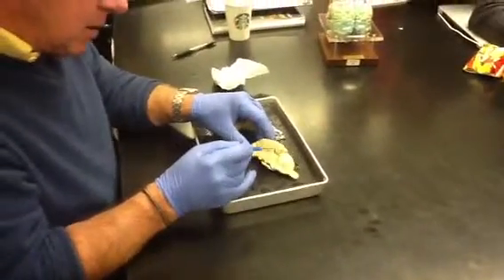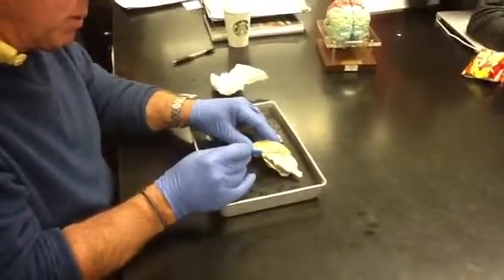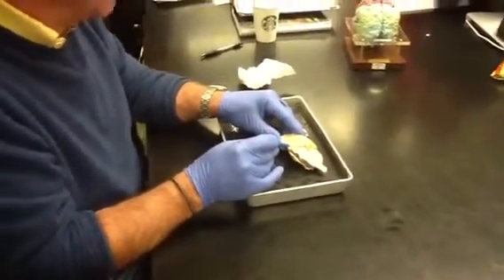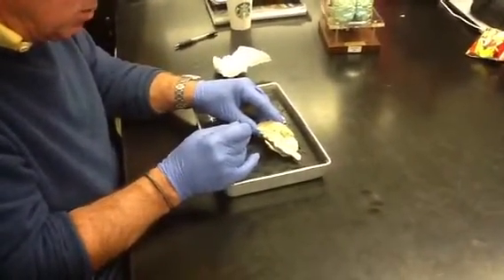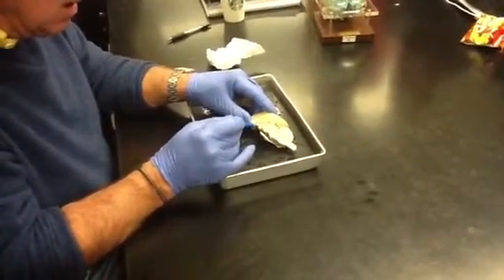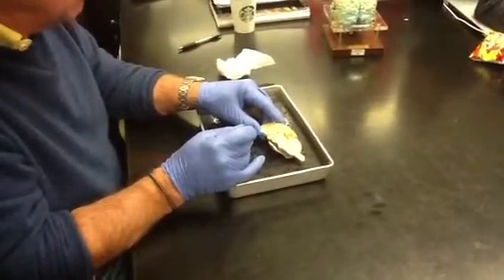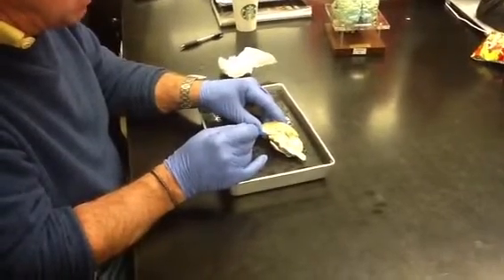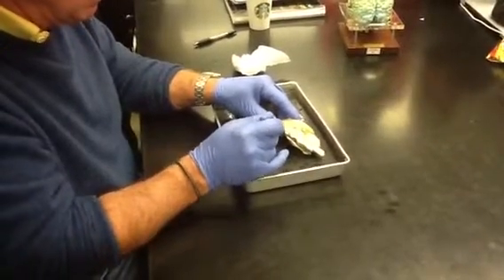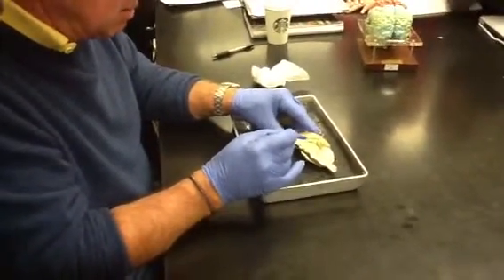Let's see. This little round structure, which is cut in half right here, I'm pulling up with my pointer, that's the pineal gland, the body clock gland in humans. This round area that I'm outlining right here with my needle is the area of the thalamus. And so what about the hypothalamus? If right here in the center is the thalamus, the hypothalamus is a little bit anterior and below it. It's not a distinct area, but it's right in there. That's where the hypothalamus is.